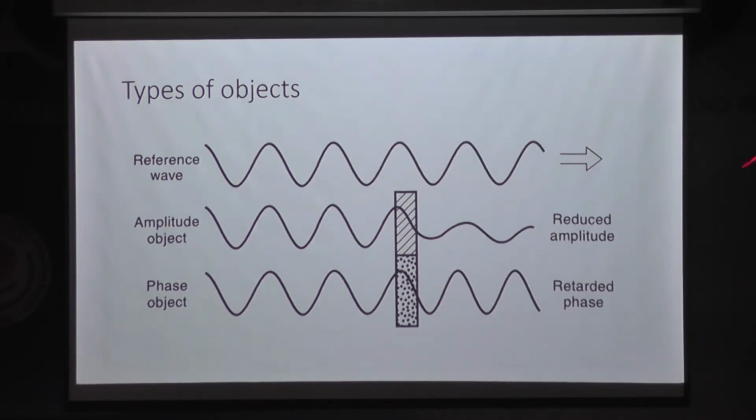Technically we need to understand when this is used. In bright field, most of the time this particular phenomenon is working, because the light is reduced. Let us say there is something clear, just glass, and something placed on the glass. Just because of that hindrance, there is less light coming to the objective and the eyes, and that is where it reduces the amplitude and creates the contrast.